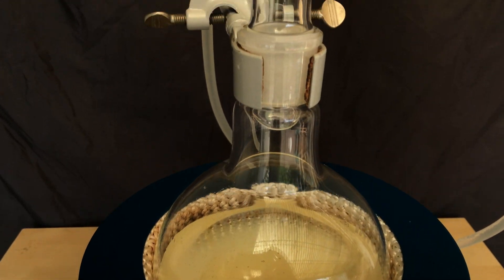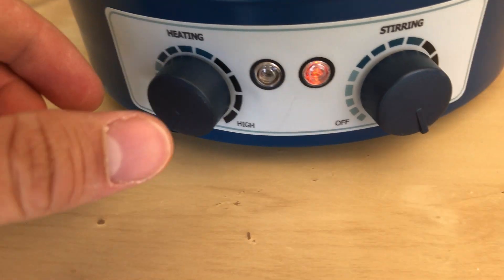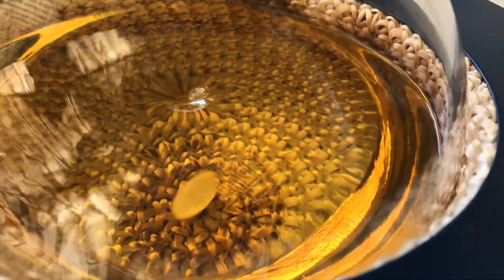To start the actual reaction I threw in a stir fish and attached a reflux condenser. We need to reflux because for this reaction to work high temperatures are required. Without a reflux the ethanol would simply boil off, but with a reflux I don't need to worry about that. The color changed from clear to what you see on screen right now.